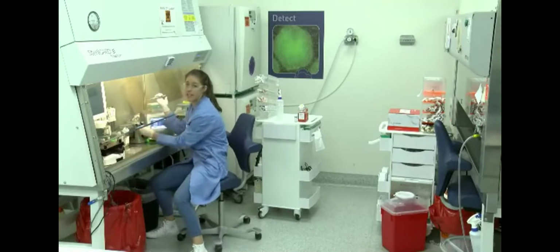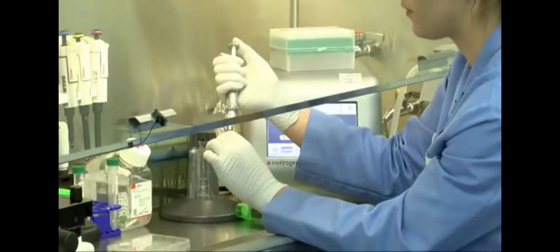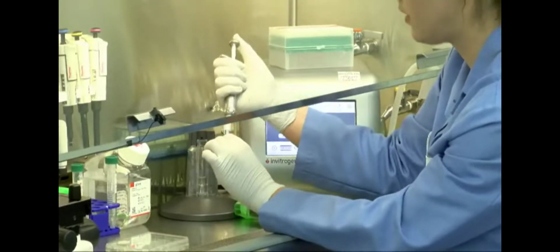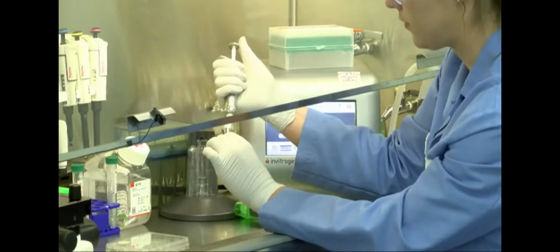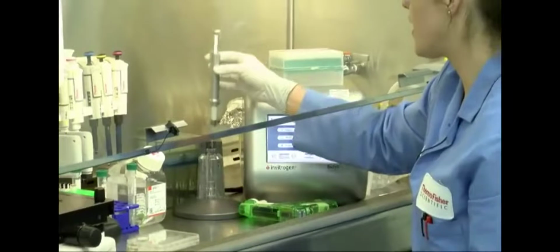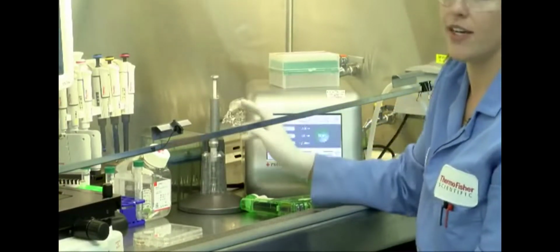Then you can take your cells plus payload complex and just pipette up 1 pipette volume. Try not to get any air bubbles in there because that could affect your transfection. And then you want to just put the entire pipette with the tip and your cells in it into the pipette station. And make sure you push all the way down until you hear it click into place.